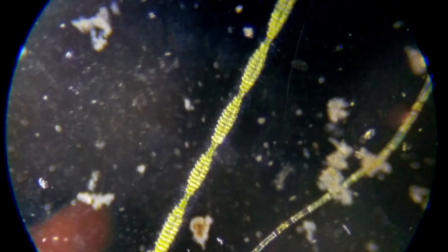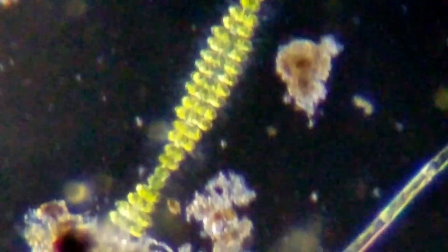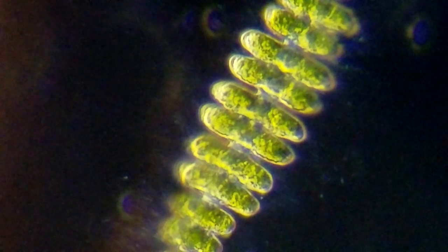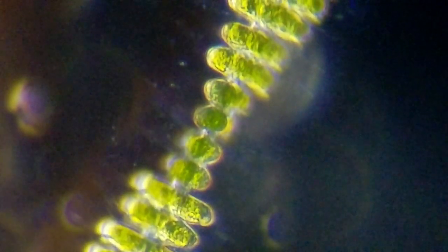Now I'm still amazed with this right here because this is intricately made. It's like algae or something like that but I haven't seen it quite like this. I'm looking at — it looks like little hairs or something coming off of it, what I'm seeing here. Look at that. Let's try to enlarge it a little bit — let's go to 250 power and see what we can see with that. Okay this is 250 power. You know there's a pattern — it's kind of large then it goes to small and then it's large again, then it goes to small.